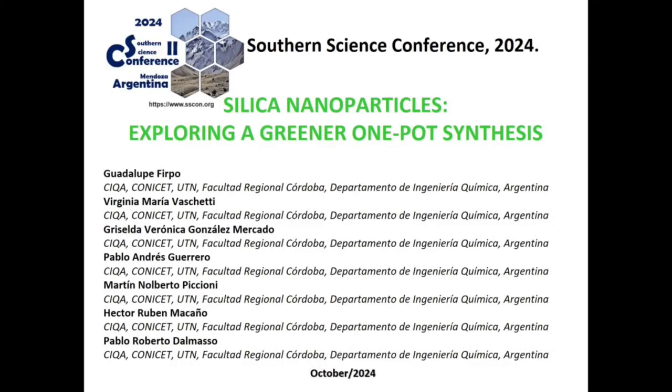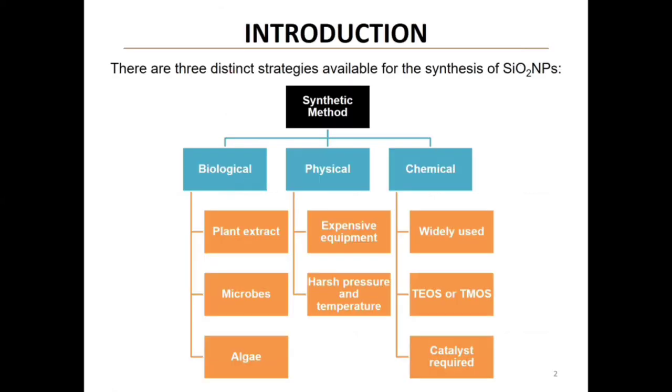Hello, my name is Guadalupe Firpo, and I am going to present you the work entitled Silica Nanoparticles, Exploring a Greener One-Pot Synthesis. There are three distinct strategies available for the synthesis of silica nanoparticles: biological, physical, and chemical.